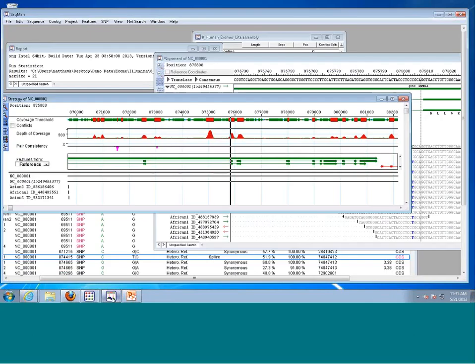in the Lasergene suite. Of course, DNAStar has customers worldwide and for many years, so there are many users of the SeqMan Pro software. SeqMan Pro allows us to visualize the output from SeqMan Engine. So SeqMan Engine will create a bam.assembly file or a SeqMan file. We can open this in SeqMan Pro and take a look.